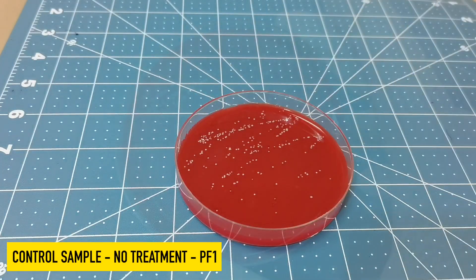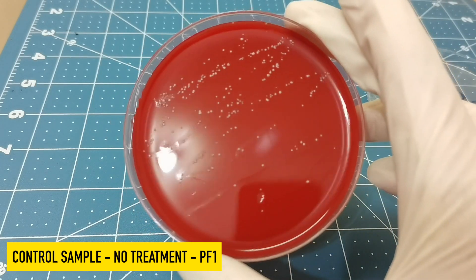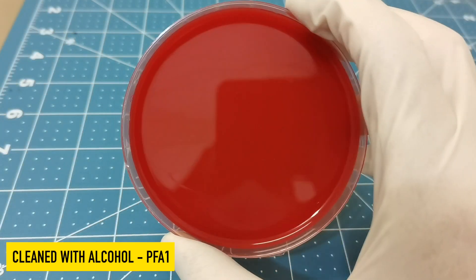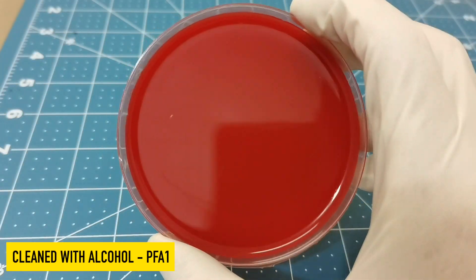And after 24 hours, this is how our control sample looks. You can see there's quite a bit of growth. But if you compare that to the phone after it was cleaned with alcohol, you can see it is absolutely spotless. There is no growth on the Petri dish.